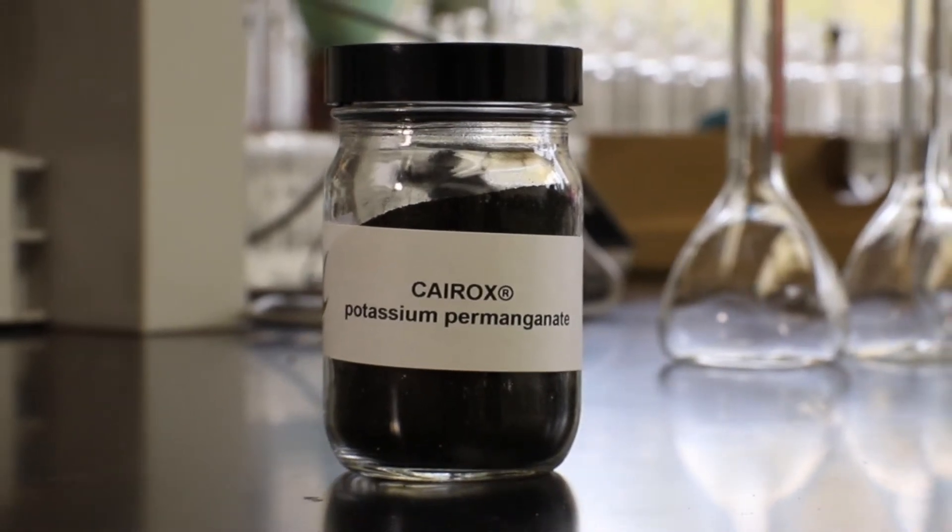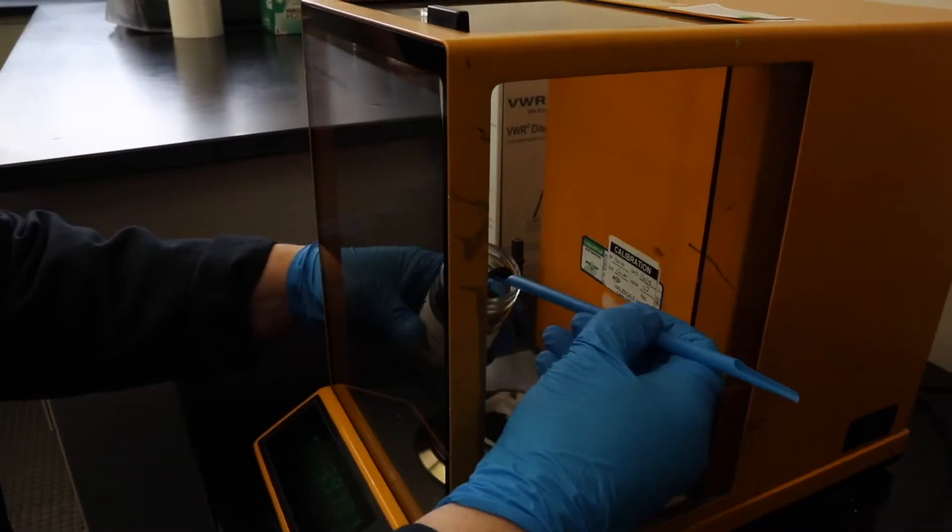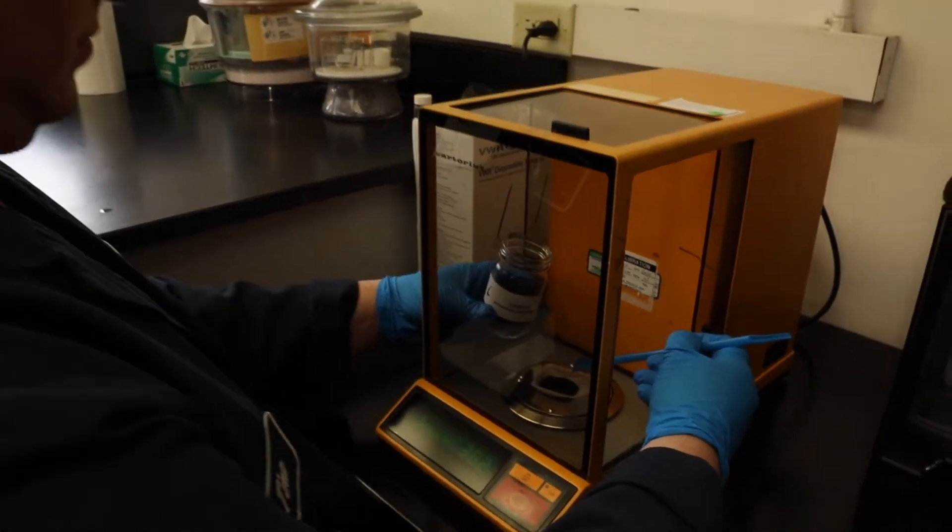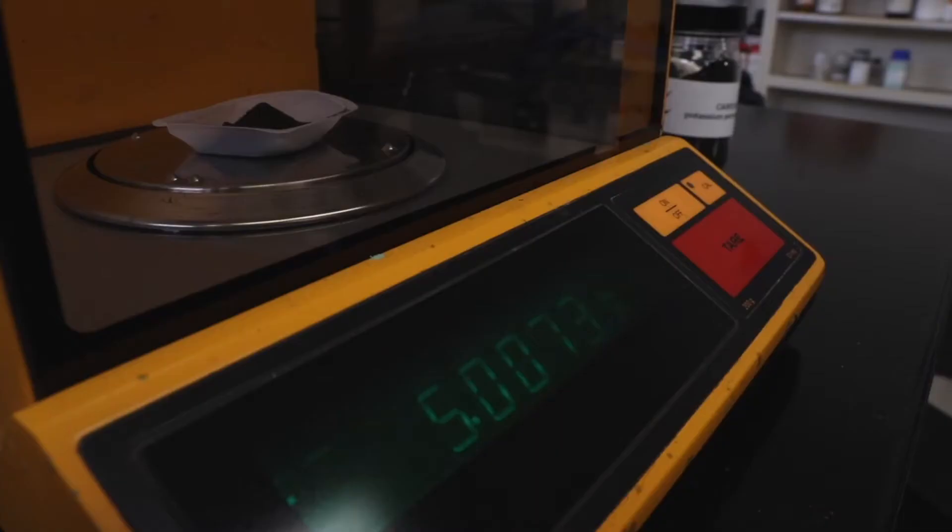This method will cover making a stock solution with Cairox potassium permanganate. Place 5 grams of Cairox potassium permanganate into a 500 milliliter volumetric flask.